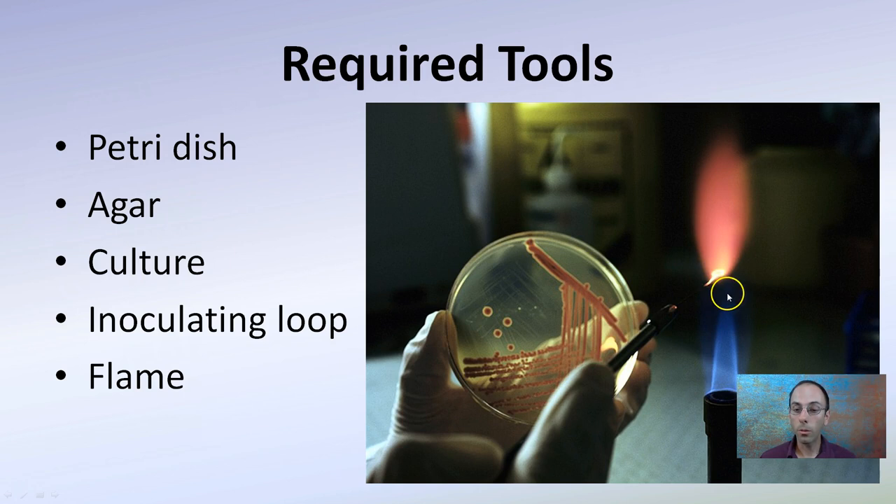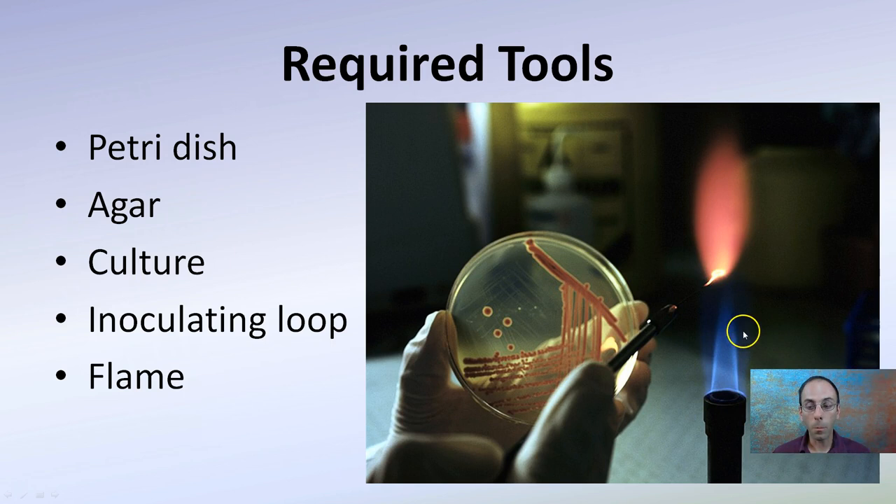Now we're going through and flaming the inoculating loop. Here we're using a Bunsen burner. It's important to keep in mind that the top of that middle cone is the hottest portion. You want to be way up here when you're sterilizing. That very top portion of that center cone is the best and hottest part when you're looking at sterilizing your inoculating loop.